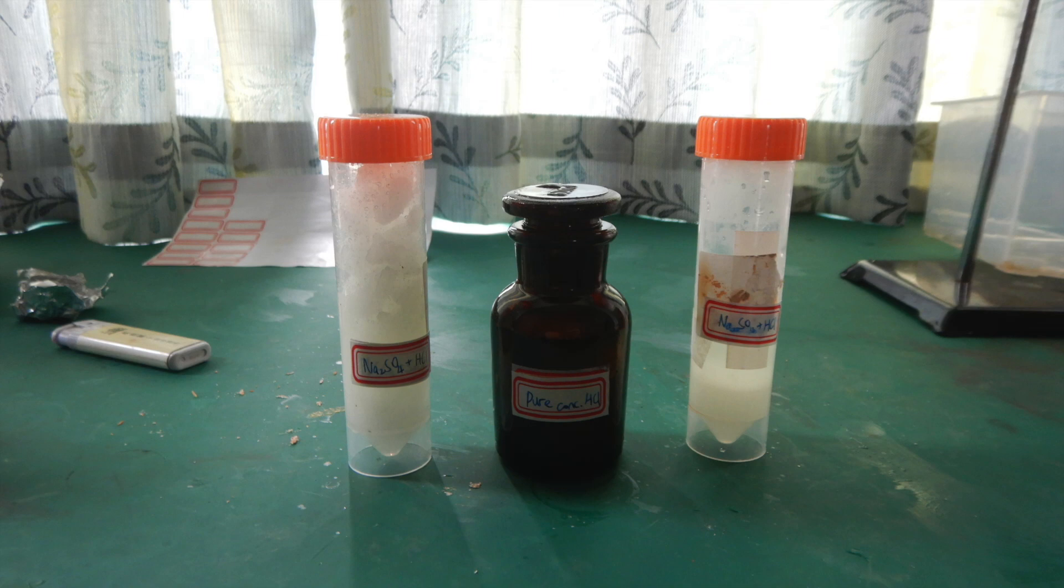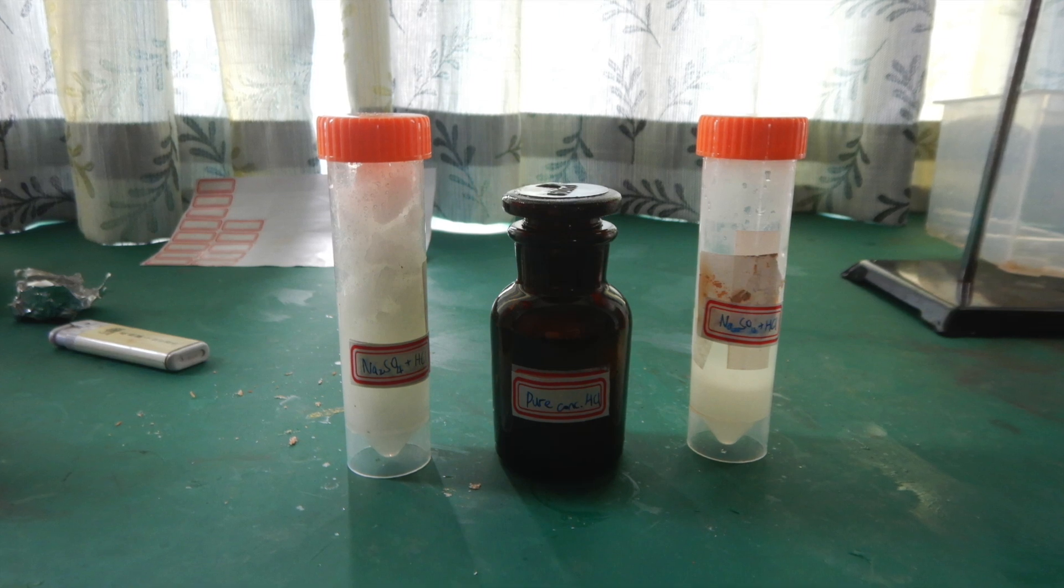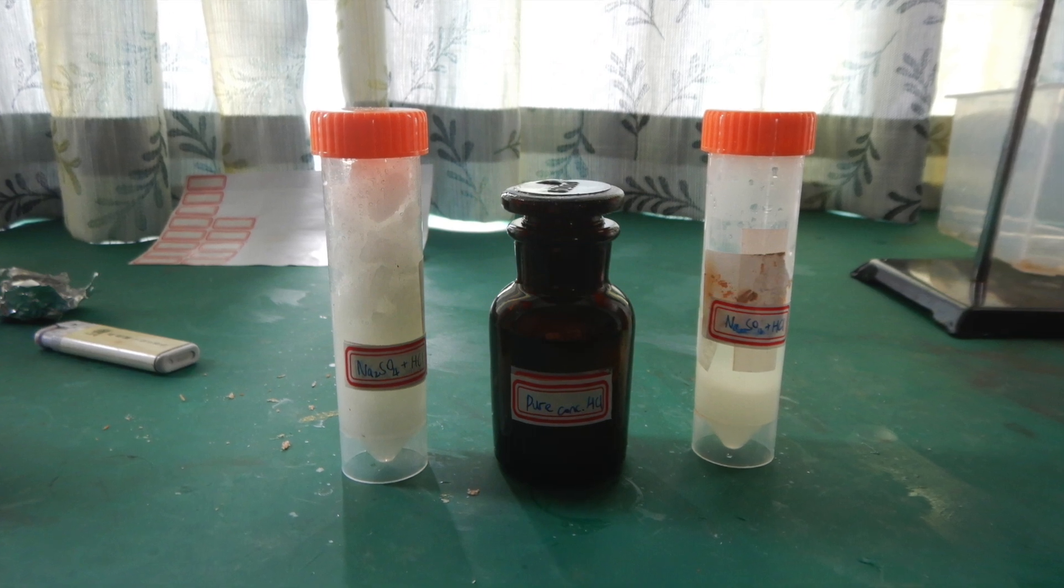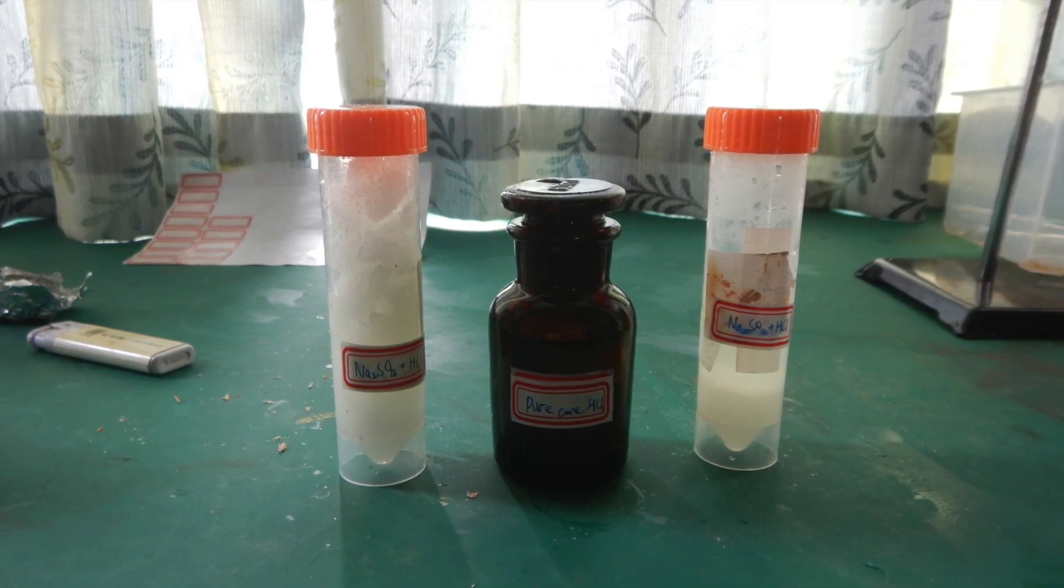So here is what we got. 66.5 grams of pure, azeotropic hydrochloric acid in the reagent bottle, and 2 bottles of residue from the conical flask.